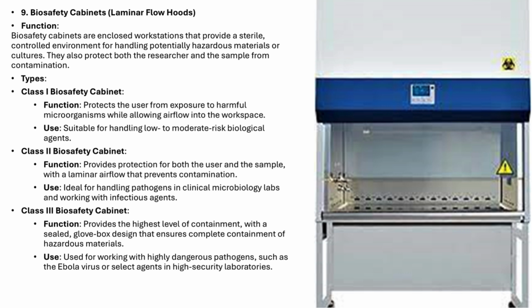Class 2 Biosafety Cabinet. The Class 2 Biosafety Cabinet provides a higher level of protection, both for the user and the sample. It uses a laminar airflow to prevent contamination of cultures, making it ideal for handling pathogens in clinical microbiology labs. It's perfect for working with infectious agents, ensuring a sterile environment for both the researcher and the sample.